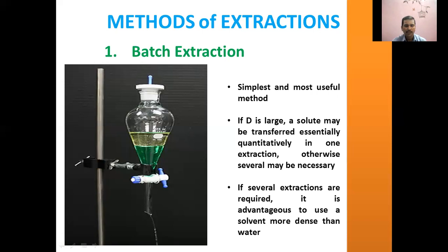Batch extractions are liquid-liquid extractions performed using a simple separatory funnel. Whenever it is not possible to perform the extraction with sufficient efficiency, with the best quantitative extraction, then we will go for multiple extractions, and these are called batch extraction techniques.